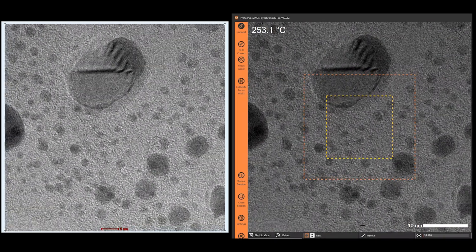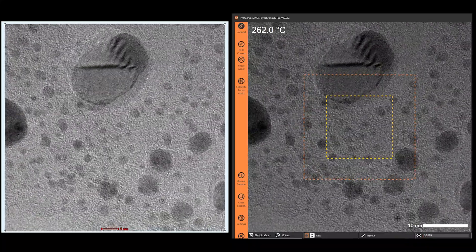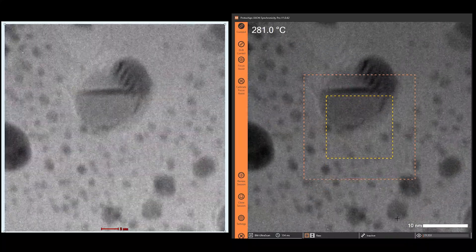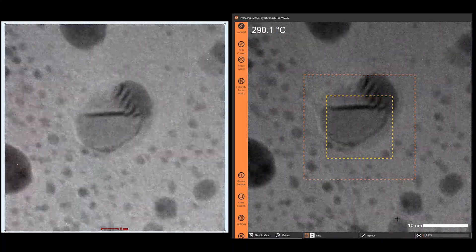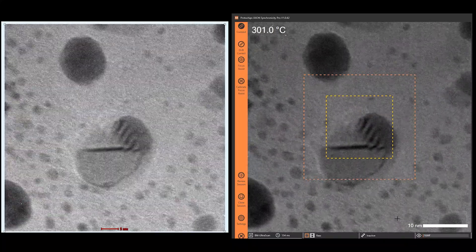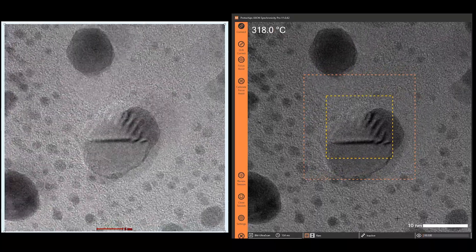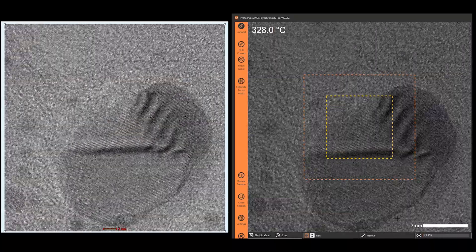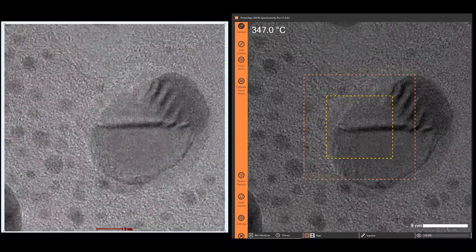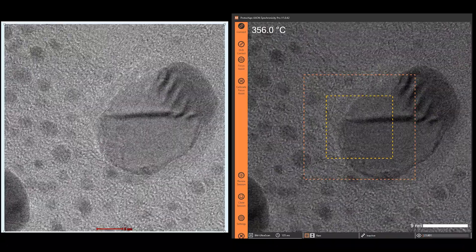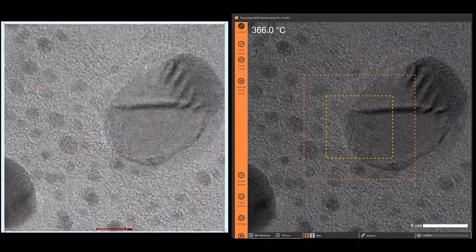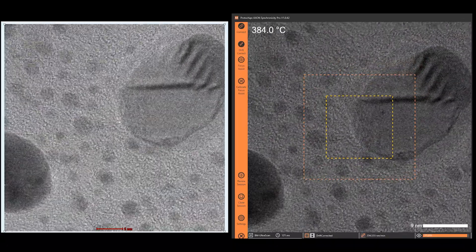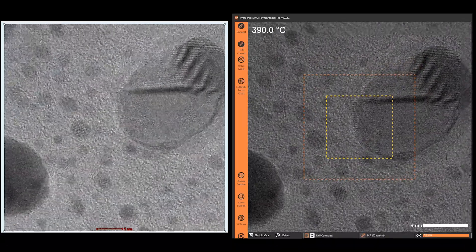Since heat makes the sample unstable, normally a TEM operator must constantly reposition and refocus the image throughout the entire experiment. However, with Axon, use the two embedded boxes on the Axon display to define your area of interest and halt all motion by engaging the Axon drift correction.